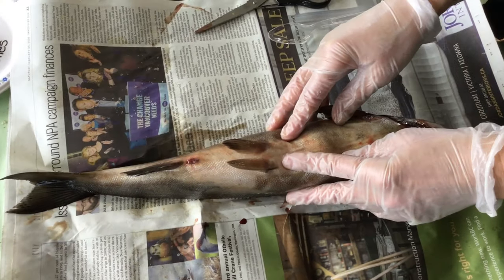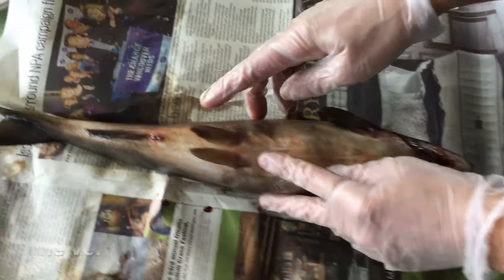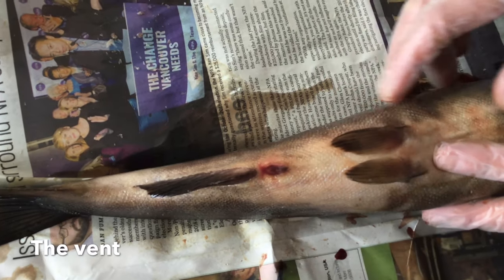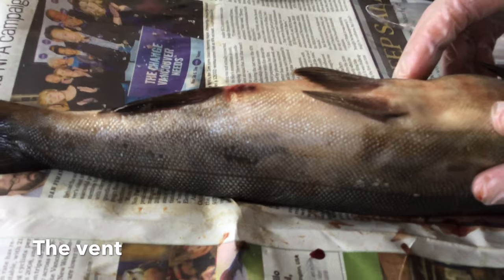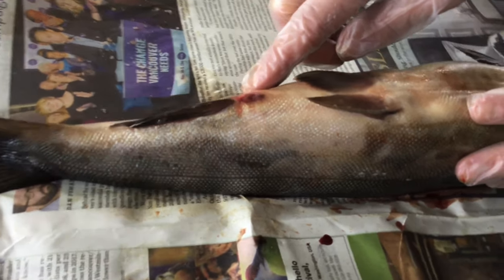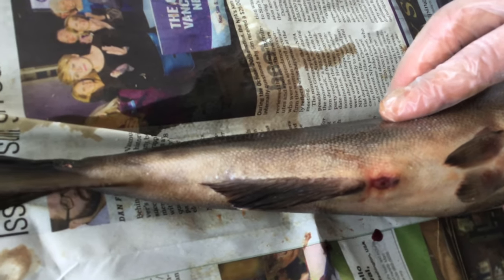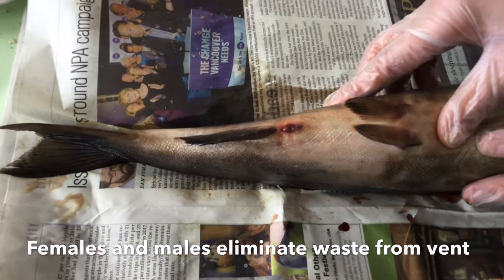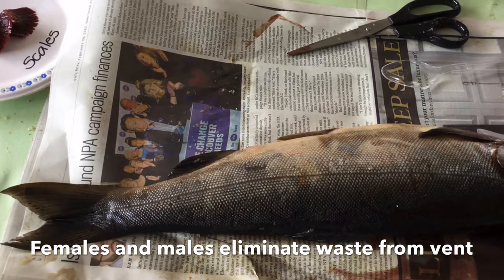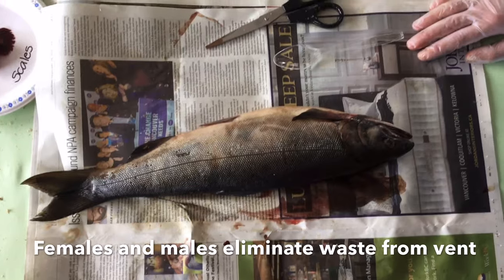The final part of the external salmon anatomy we'll look at is the vent. Ms. Anima's indicating the vent. This is an opening on the underside of the fish. Eggs are laid here by females. That's where they come out. Milt is released from here by males. And both the males and females eliminate waste as well from the vent. So that is the conclusion of the external anatomy of the salmon. Part two, we are moving on to the internal.